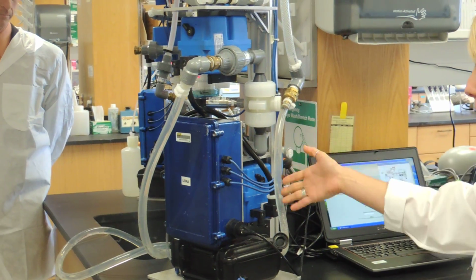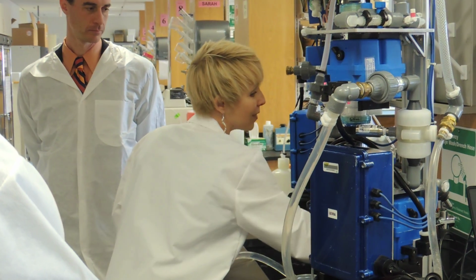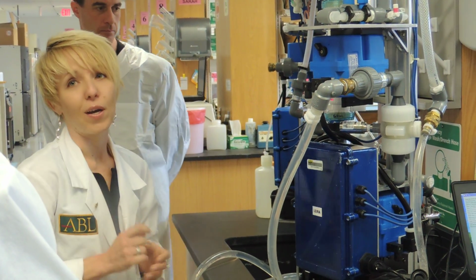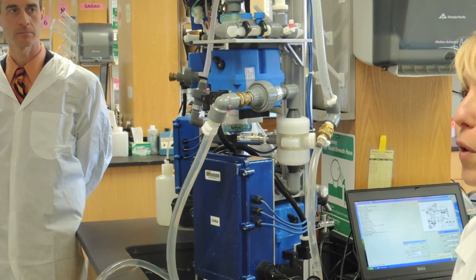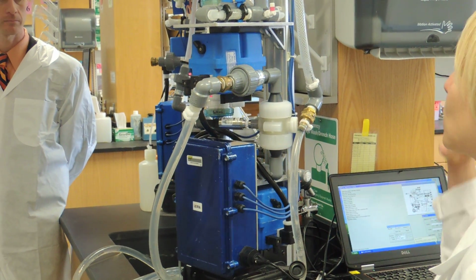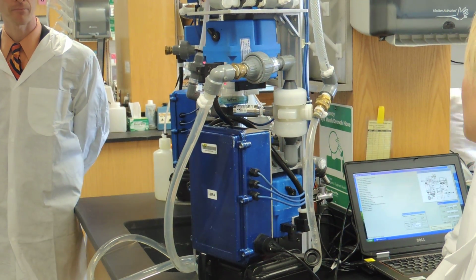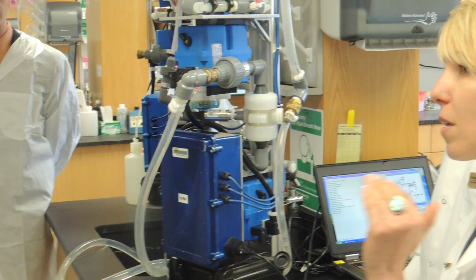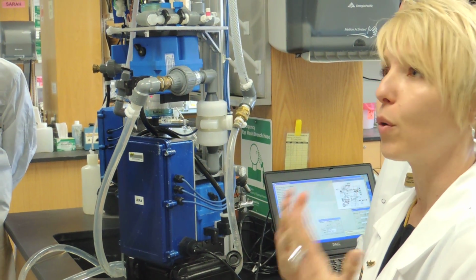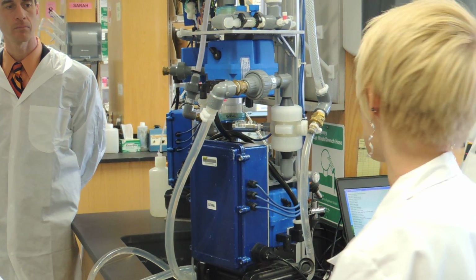So once you are happy with the amount of fluid that you have collected, you can just simply cut off the flow, tell the computer that yes, I am ready to go back to the lab to do the recovery portion of the demonstration today, where you will then be able to remove the organisms back from that filter. So it will start to turn off the flow meter, turn off the pressure transducers electronically, and then all of the valves will then close back up to keep all of the organisms trapped within that filter encased within the filter, so you don't have any loss, there's no aerosol generation. So that you can then just transport back to the laboratory.